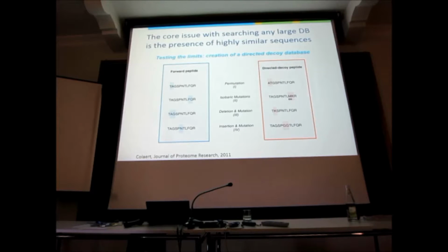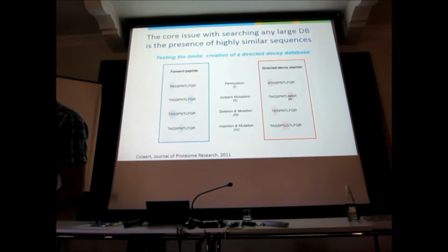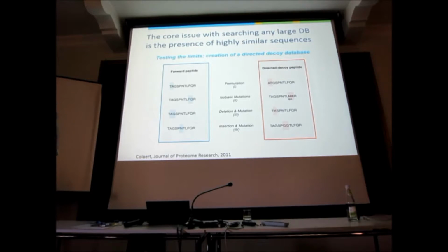And then these 70,000 peptides, we started making these photoshopped versions, these imitators. So we permute some of the amino acids. That's a stupid trick. You switch them around in location, and you can do that across the whole sequence. But they stay isobaric. You do isobaric mutations. F and Q together have a roughly similar weight as a methionine oxidation and a lysine. This is actually ion trap data that we use for this. So, an ion trap cannot see the difference between these guys.